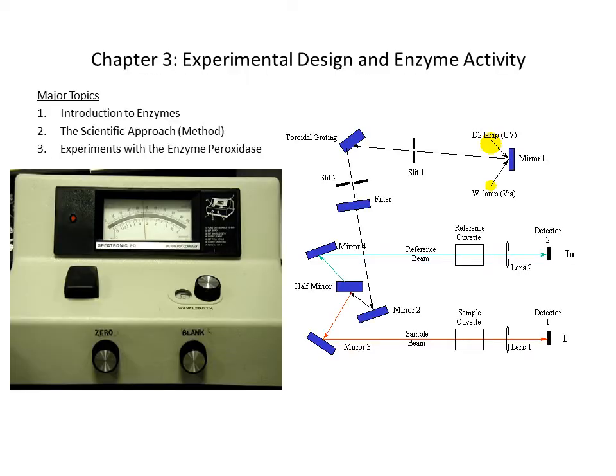Okay, so today we have to use a spectrophotometer. Let's take this word apart. Spectrophotometer. I'm going to get class feedback on the recording. Meter, what does that mean to you? Measure. Measures, great. Photo, what does that mean? Light. So measures light. It's great. What's spectro mean? Range. A range. Outstanding.